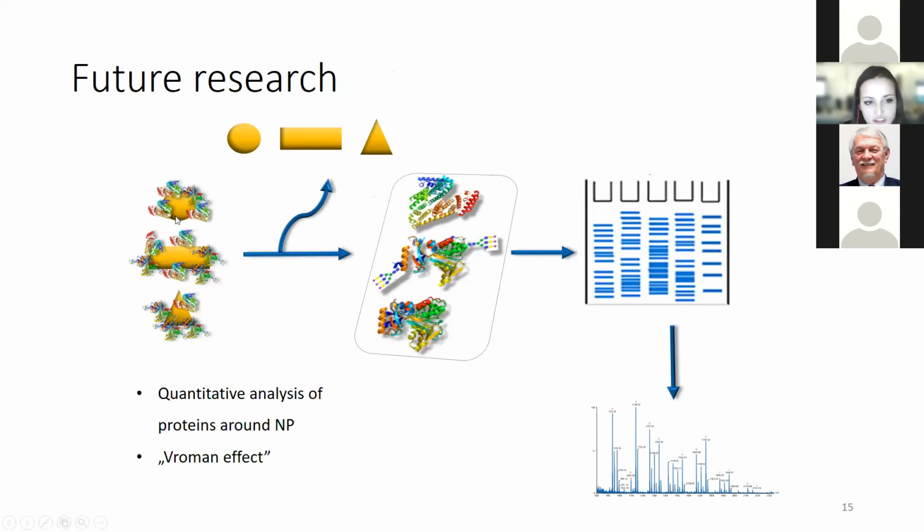Our future research would be to see the competitivity in binding between all three proteins. We're going to incubate all three proteins with differently shaped nanoparticles individually. And after incubation, we're going to detach the nanoparticles and analyze the composition of the protein corona using SDS-PAGE and mass spectrometry.